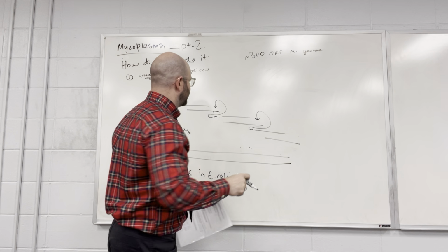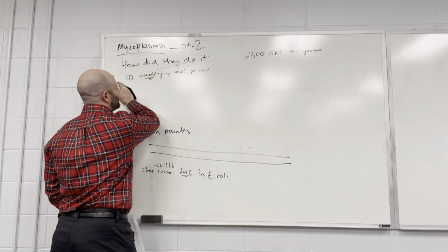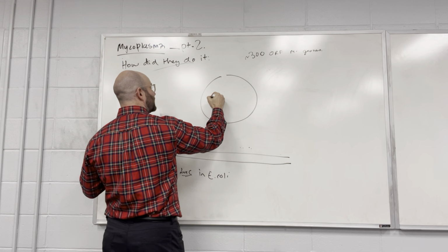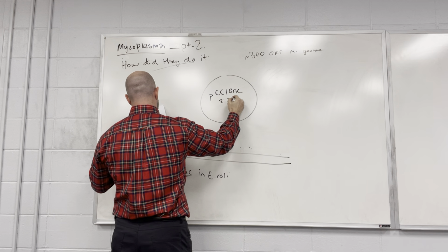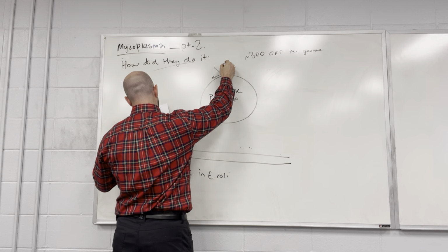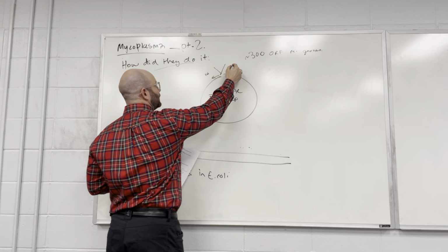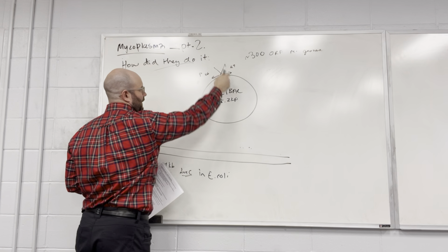Okay, let me erase this, and let me actually draw that part of the figure. Hopefully everybody's got this. So this is in figure 1B. They have something that looks like this. What is this showing you? The primer design? Yeah, so these are their primers, primer 66 and primer 69.